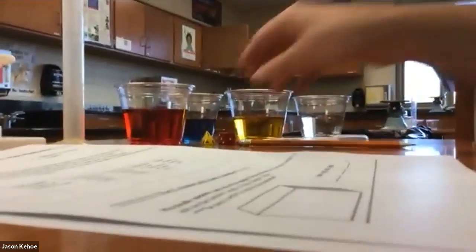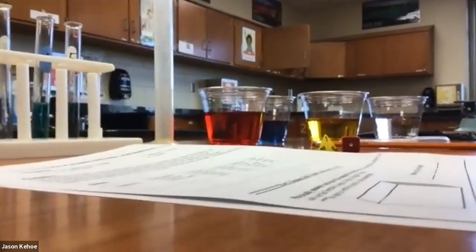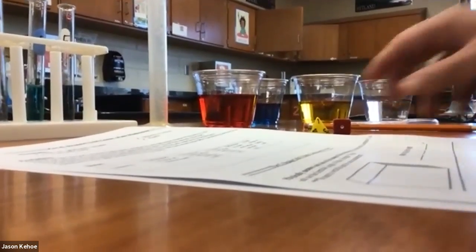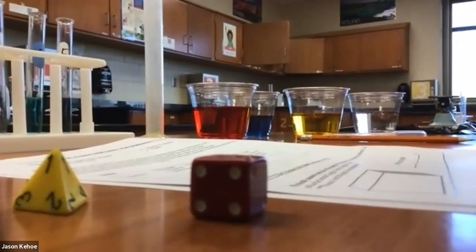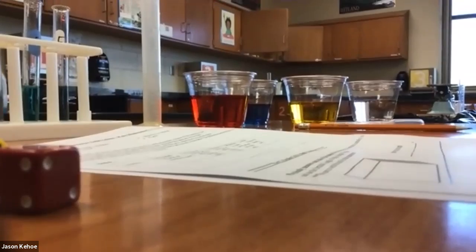So these directions, the objects, by the way, is dice, a 4-sided die and a 6-sided die together. That is the item we're going to be finding the volume of. So fill the second column, estimated volume, by estimating the volume of these items. I will leave that to you. In cubic centimeters, or centimeters cubed, what do you think the volume of these will be together? And you'll fill that into that first column. It's really the second, estimated volume of items. The first one would just be naming the items, in this case, dice.